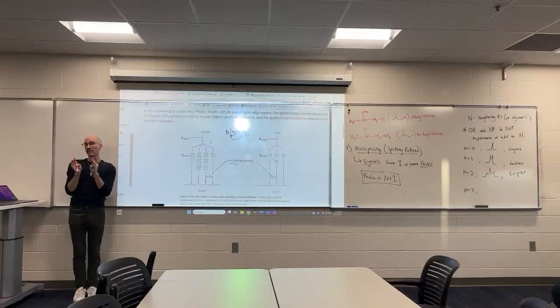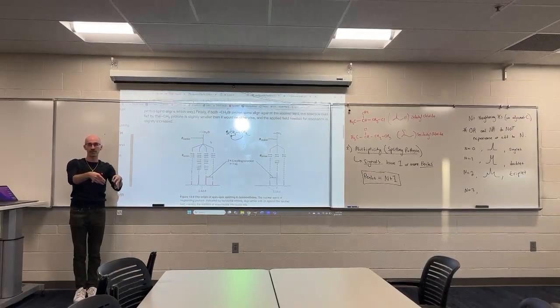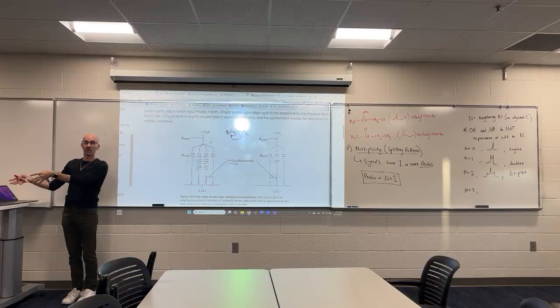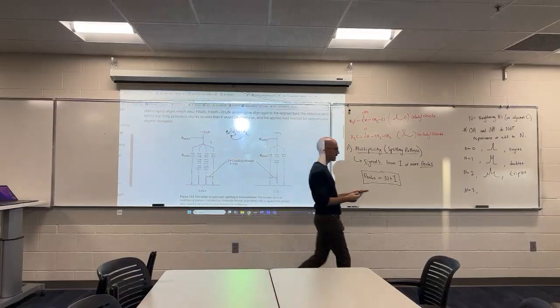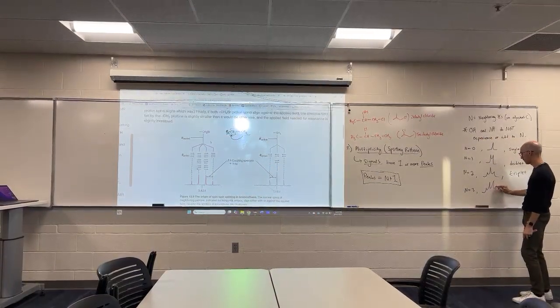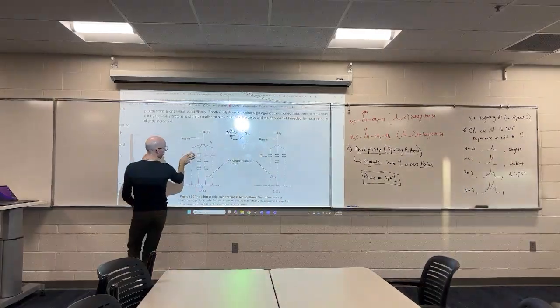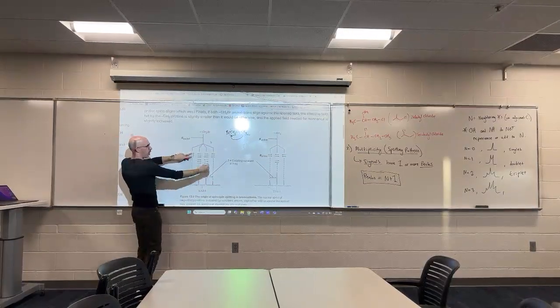So you should always be able to analyze an NMR and say, well, if I'm seeing that this signal has 3 peaks and that it has 2 neighbors, then I should find 2 neighbors somewhere that have 3 neighbors. And when n equals 3, the number of peaks equals 4. And here we get some symmetry back, because those 3 neighbors can be all aligned one way or all aligned the other.